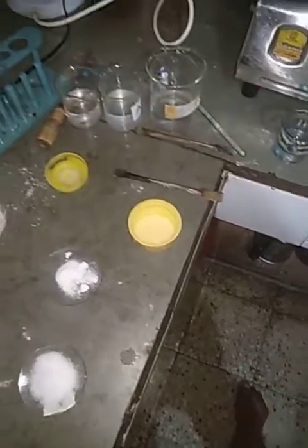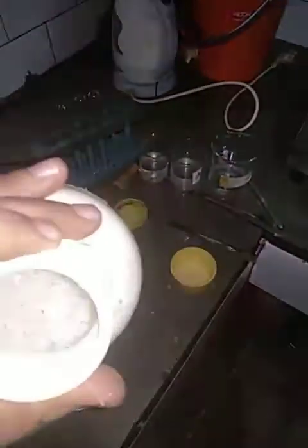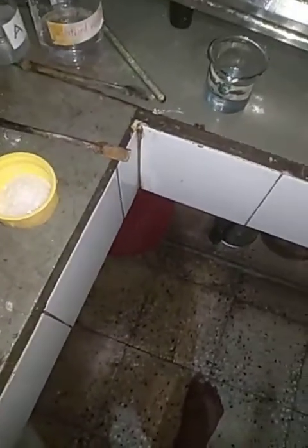And then we have the third sample, which is barium chloride. You can see the crystals of barium chloride. They are solid in state, and we'll take some of the crystals out of this barium chloride. So now you can easily see that all these three compounds are solid in state, they are hard. Now we'll check whether they are brittle or not.